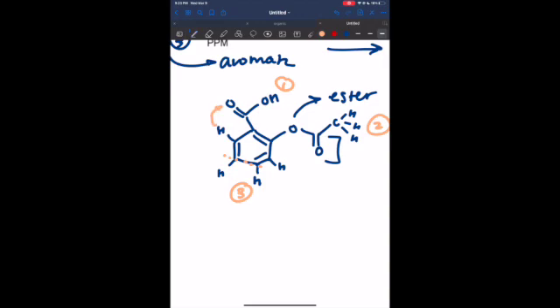This one is also adjacent to an oxygen, but it's a double bond, so it's going to be a different signal. It's also bonded to different things. So this oxygen is bonded to a different functional group. So this has an OH, this has a CH3. So I'm going to give this one its own signal.